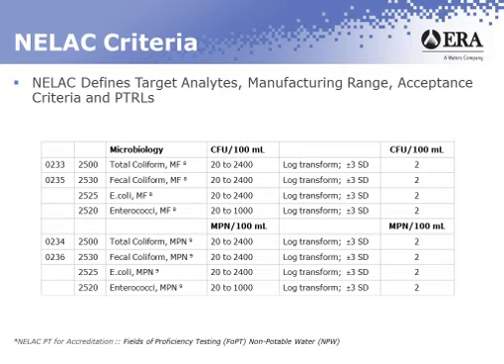The table that you're looking at right now currently defines 4 analytes. You'll see total coliform, fecal coliform, E. coli, and enterococci. You'll see that they're listed by 2 separate technologies. MF is membrane filtration, MPN most probable number. This gives us 8 separate analytes that the PT providers must treat individually.